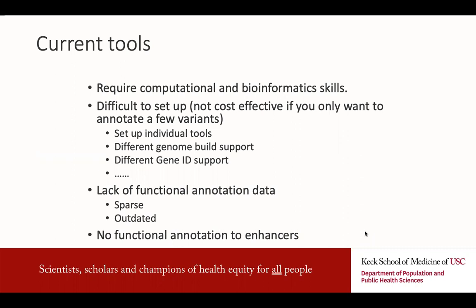The other thing is, almost all of those tools lack functional annotation. What I mean by functional is pathway annotation, biological processes, things like that. Even if they have it, it's very sparse or often outdated. There are annotations of enhancers, but there was not enough data to link those enhancers to genes. Thus, we don't know what these enhancers do and what functions they are involved in.